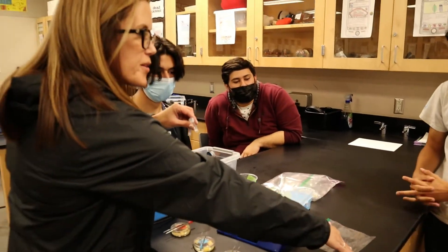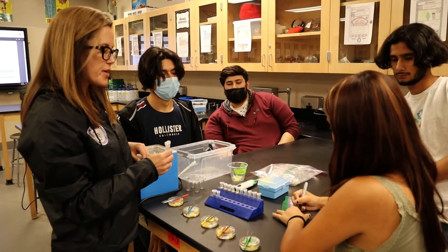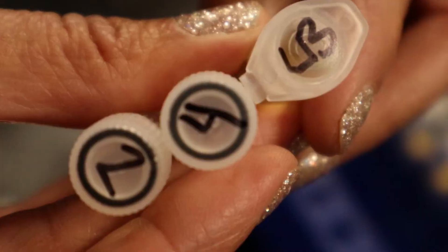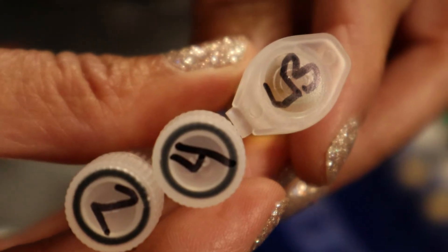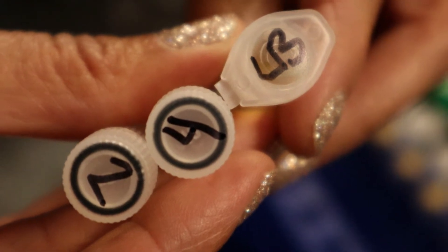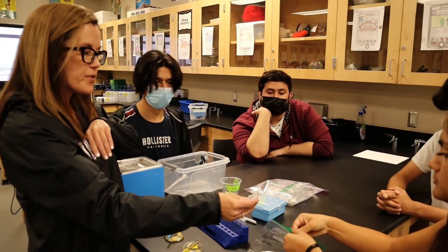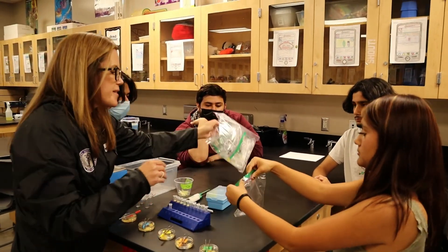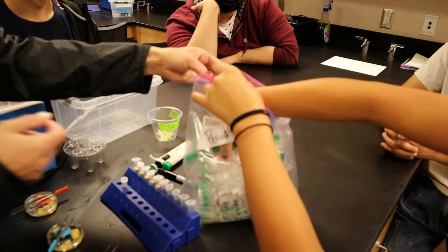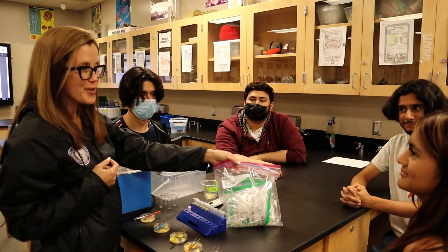If you don't mind labeling this bag with your group name so that we can find it next period — we're going to refrigerate these samples overnight. The only things that we need to keep for Module 2 are our two positive samples that we incubated and added lysis buffer to, and we also need the excess lysis buffer. Go ahead and put these in your sample bag, and then you'll put that bag in the class period's bag so we can find it tomorrow. This will be refrigerated overnight and we'll pull them back out for Module 2. Thank you so much for your help, everyone.